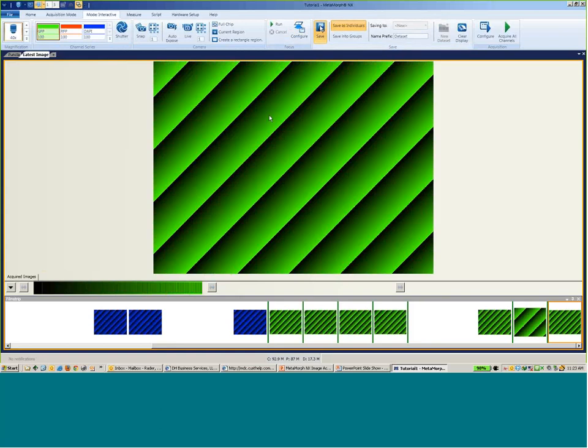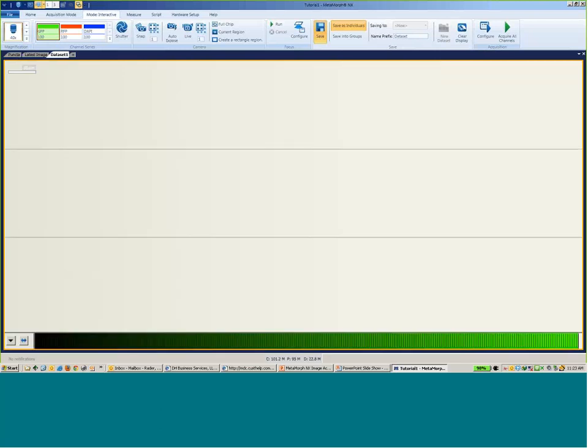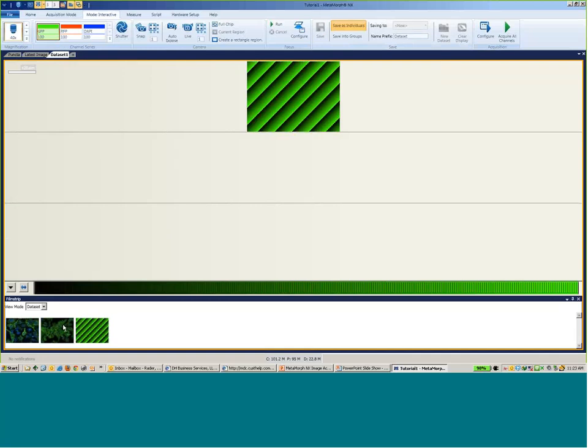Then it'll calculate more or less the duration of how long that acquisition is going to take. The mode is stream to RAM, and then you hit acquire and it goes. The demonstration driver, for some reason, is not designated as being able to do a stream. So if I hit the acquire button, I'm going to get an error message that pops up saying it can't do the stream for that. But for a regular camera, you'll be able to do the stream acquisition with it.